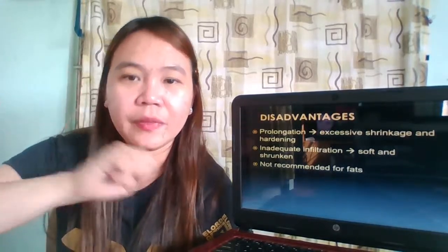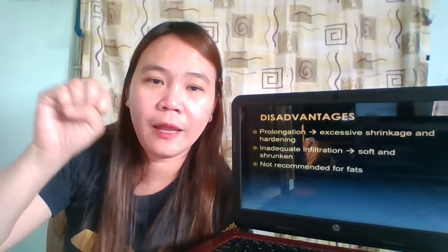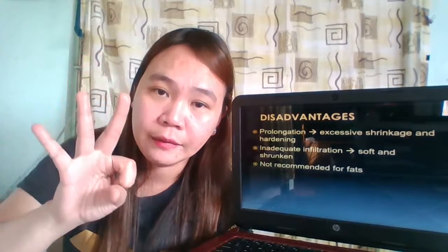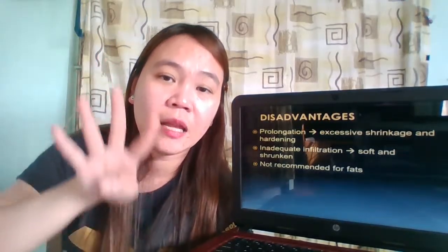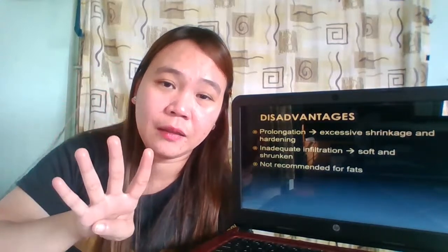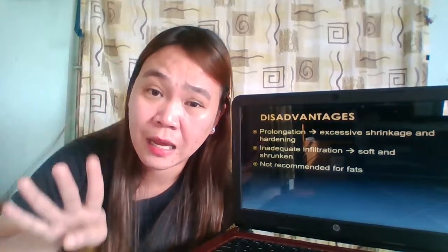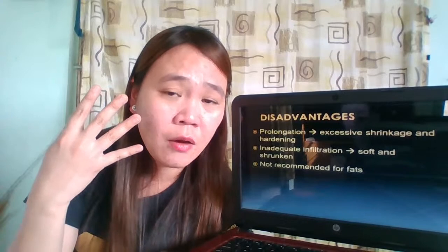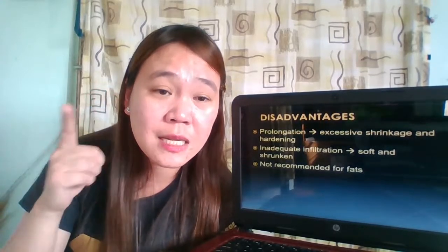Let's repeat. We have tissues which are difficult to infiltrate: bones, teeth, brain, and eyes. These tissues are difficult to infiltrate. That's why prolonged immersion is actually necessary. But please take note, for these four, for paraffin impregnation, prolonged immersion is not advisable.